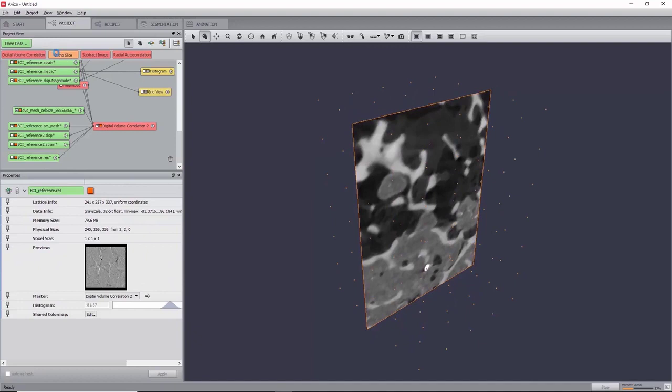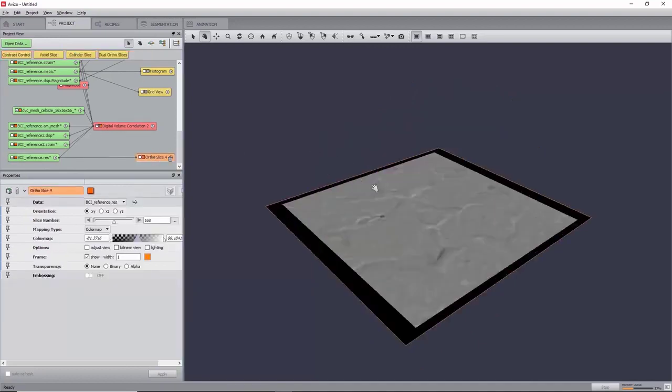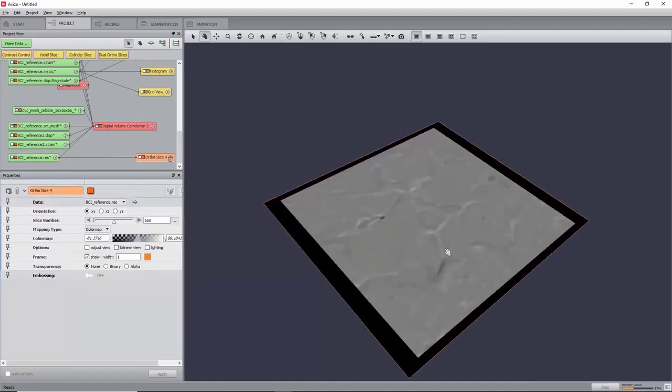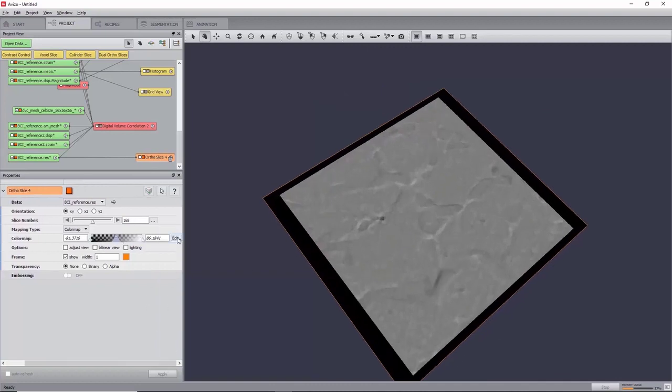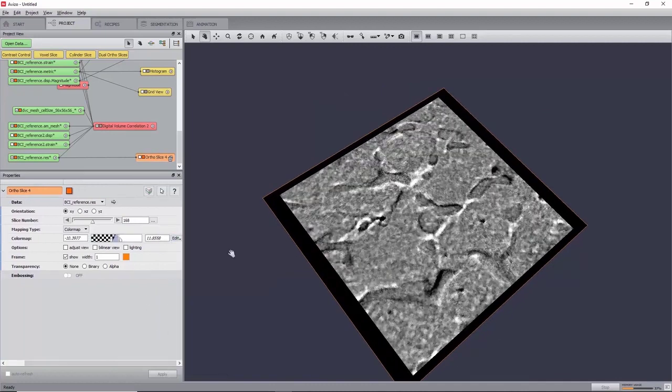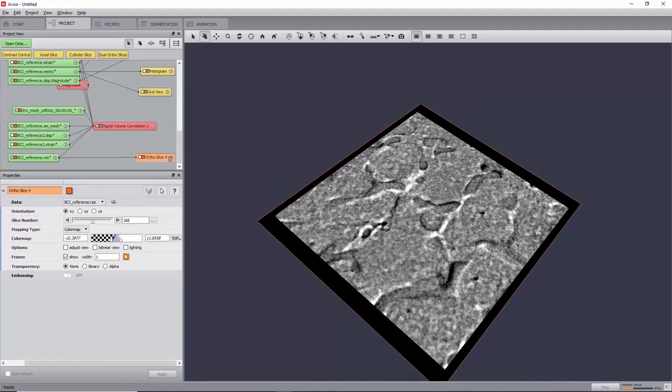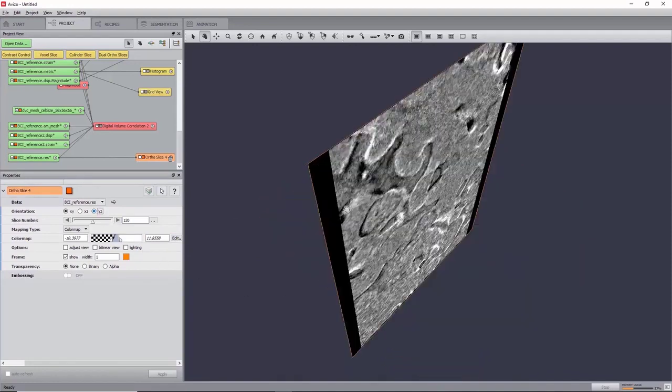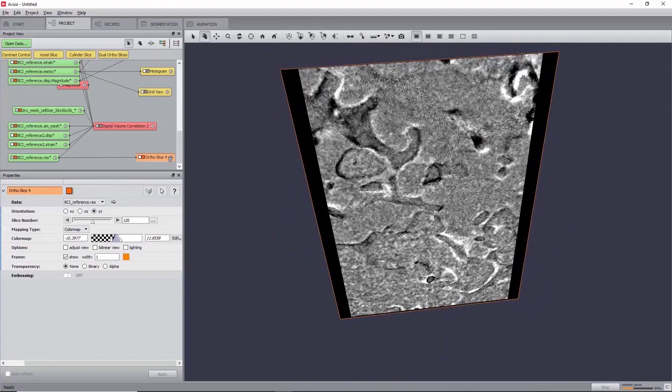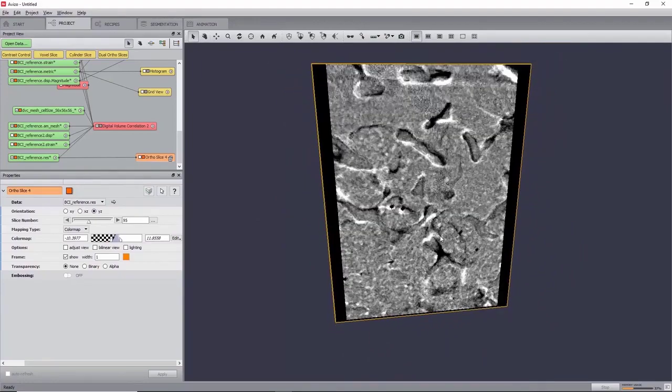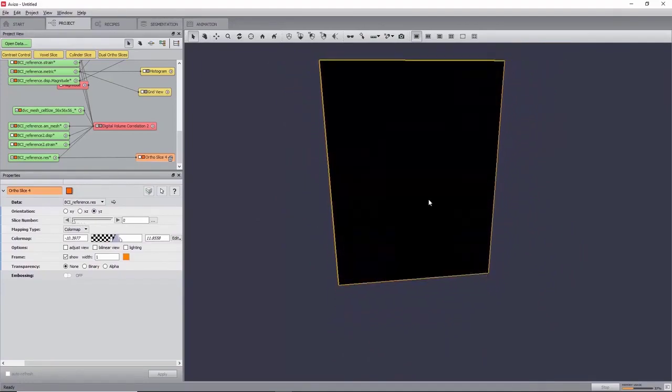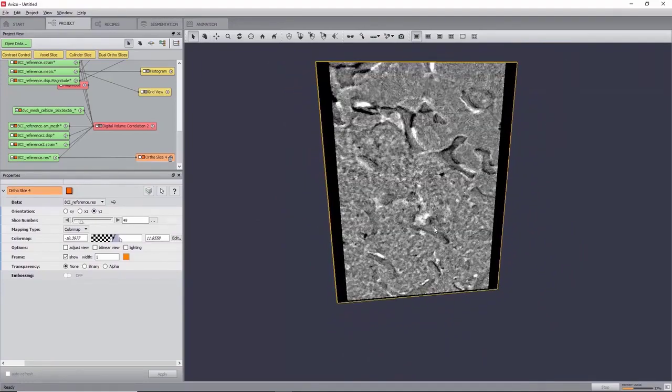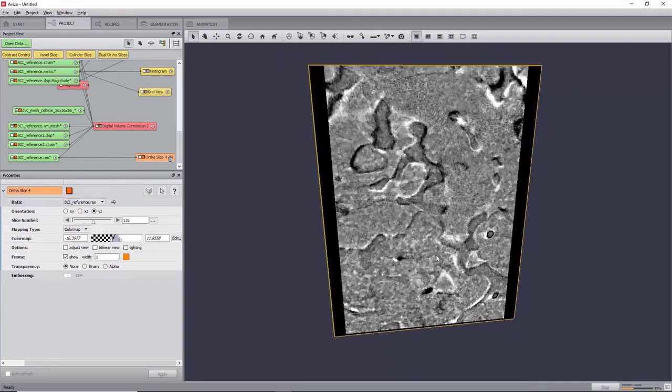To check the quality of the correlation, create an auto slice on the residual image bci-reference.res, and change the color map by clicking Edit Adjust Range to Data Histogram. Good correlation zones will have values close to 0, whereas weak correlation zones correspond to voxels with the lowest and highest intensities, and are found at the top, where the deformation is the highest.